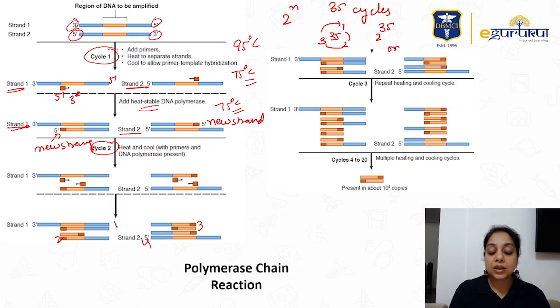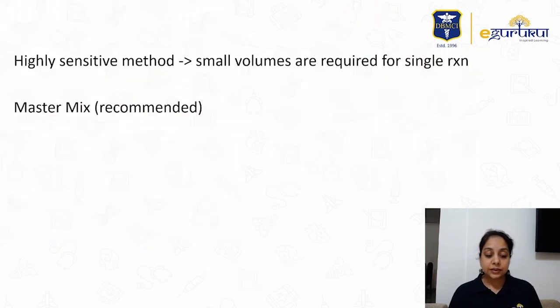or you can say that is 34 billion DNAs we are talking about here. So this much amplification is done by the PCR. That's how we are able to manage with the starting DNA being a very tiny amount, because it can be amplified in the reaction mixture via the PCR cycler. It is a highly sensitive method, that's what I mean. A very minute quantity of sample can be used as the starting sample and that can be amplified.